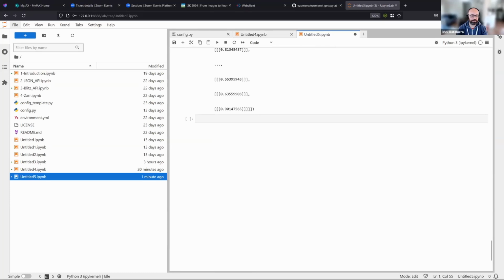You can also add things to the image itself. So for example, if I want to add an annotation to that image, I can do ezomero post map annotation, connection. And again, map annotations can be on anything, so I need to specify it's an image and the image ID. And then it's a dictionary, a Python dictionary. So if you know your Python, you know that it looks something like this.